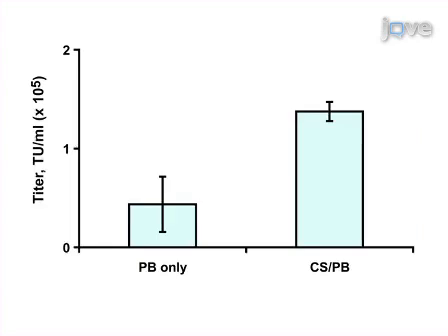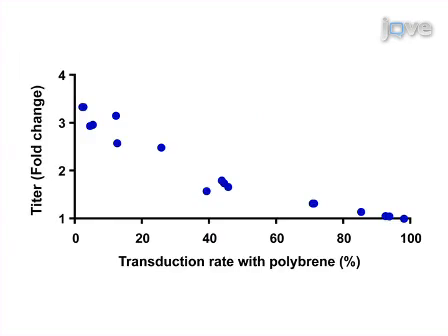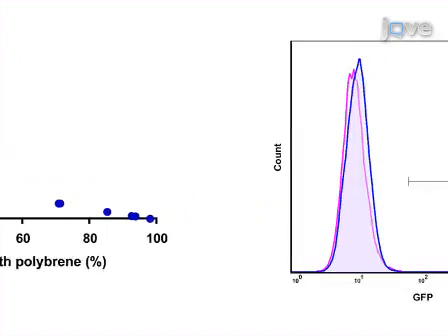Complexation with chondroitin sulfate polybrene enhances the observed titer roughly threefold in SLC-HSC. In practice, this yields a greater effect on transduction efficiency at low virus concentrations than at higher concentrations, which is most likely due to multiply transduced cells and receptor saturation at higher virus concentrations.